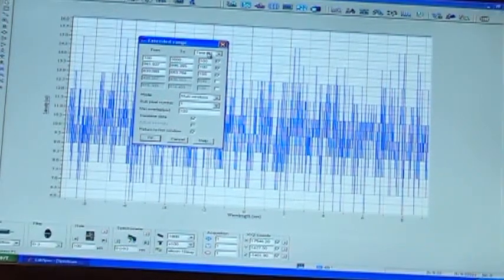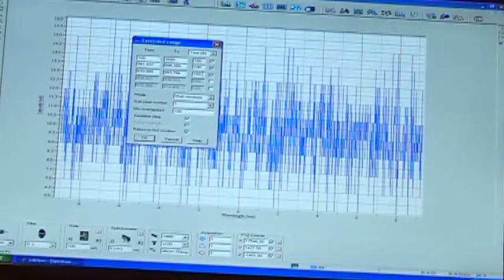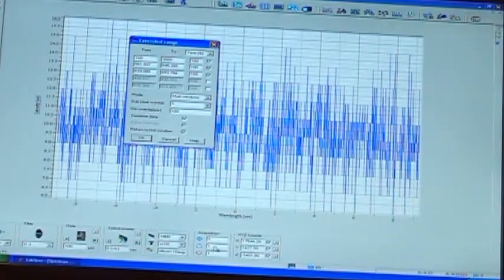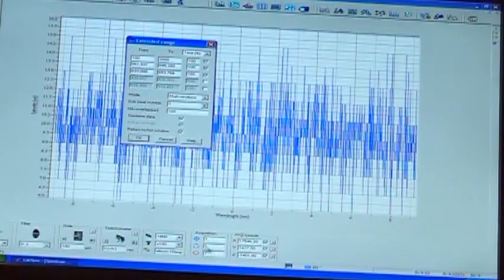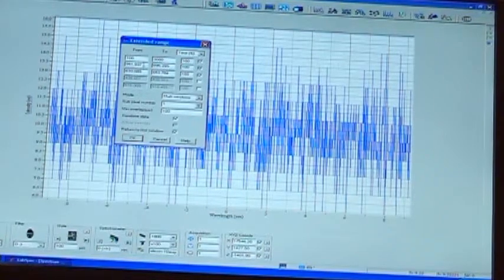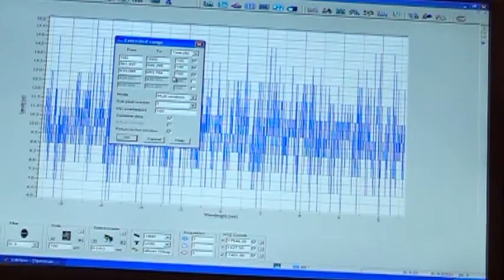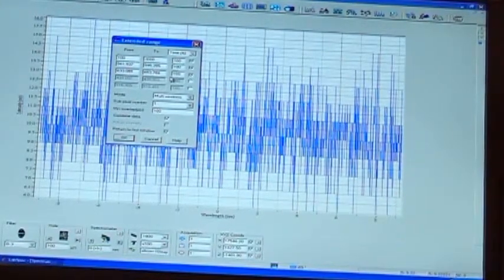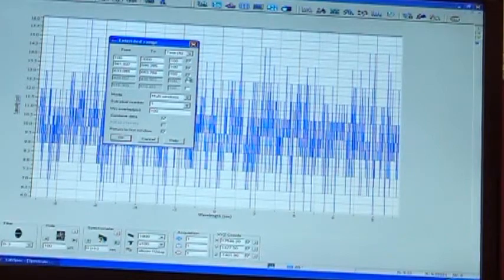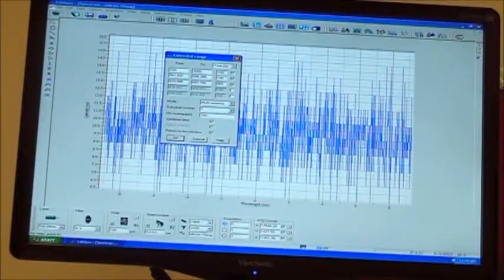And also you can set a multiple time percentage. It says time here, time percent. See, all these boxes say 100%. So that means it'll carry out the one acquisition one time down here. That's in the acquisition window at the bottom. But if in one of these several ranges that you've displayed on here, if you know that, for example, at the final range, your data peak is really, really low and it takes more time to accumulate the data there, you can actually come and rather than 100%, you could set it for 900%. So now rather than the last window acquiring for 1 second, it'll acquire for 9 seconds.